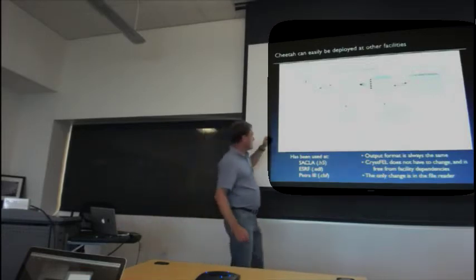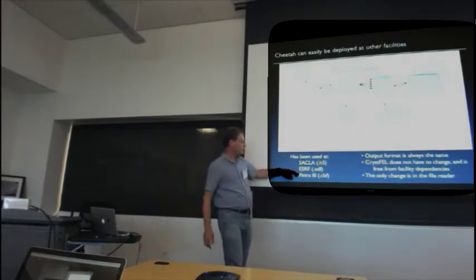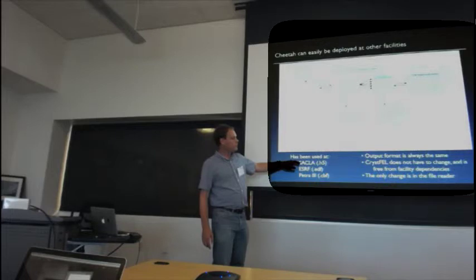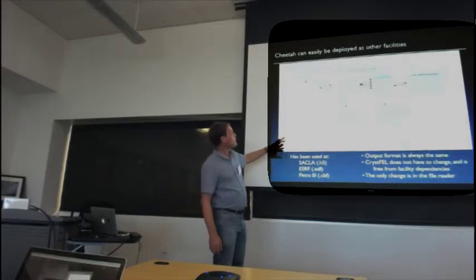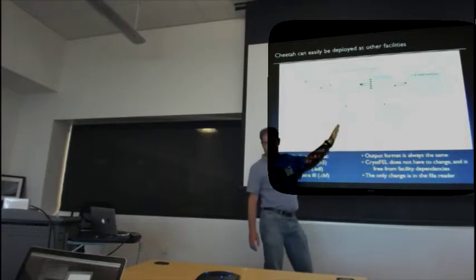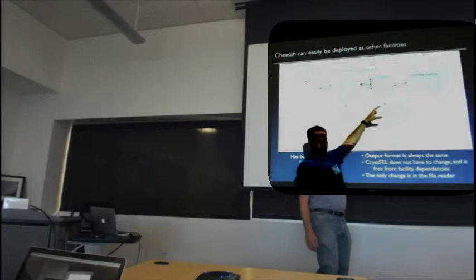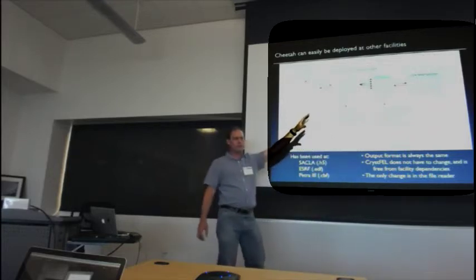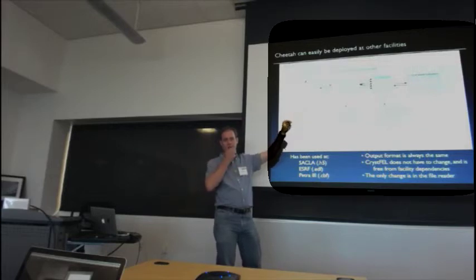Cheetah, we've used it at SACLA, ESRF, and PETRA. The reason we're able to do that is we had a modular design to the thing. Everything inside Cheetah itself is facility independent. We started off with the tendrils of the LCLS frameworks reaching all the way down into our software. And then that framework ceased to be supported for whatever reason. Trends moved on, or it wasn't quite appropriate. We said move on to something else.